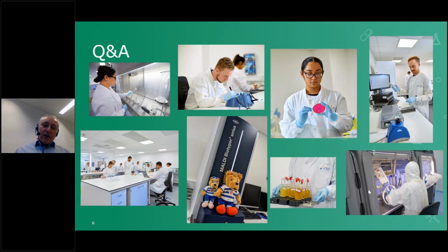But the exit suit plates can only be taken at the end of the operation, because they affect the integrity of the suit, or when personnel take breaks as well. So it's a combined approach to form a big picture. The exit suit is the overall certification, the finger plates are like the real life, what's going on while the activity is happening.